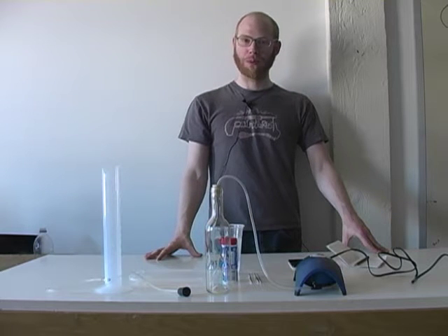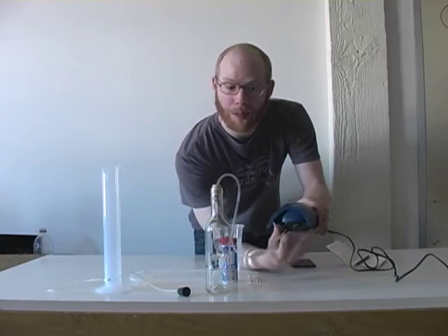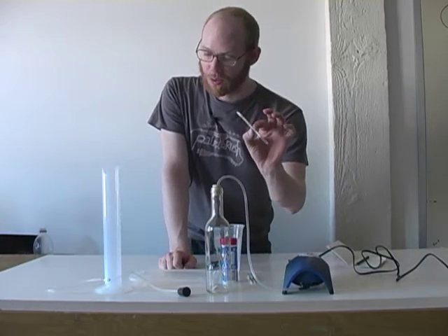Hi, I'm Matthew and I'm going to step through the process for calibrating an air pump so that we can use it with these Kitagawa tubes.